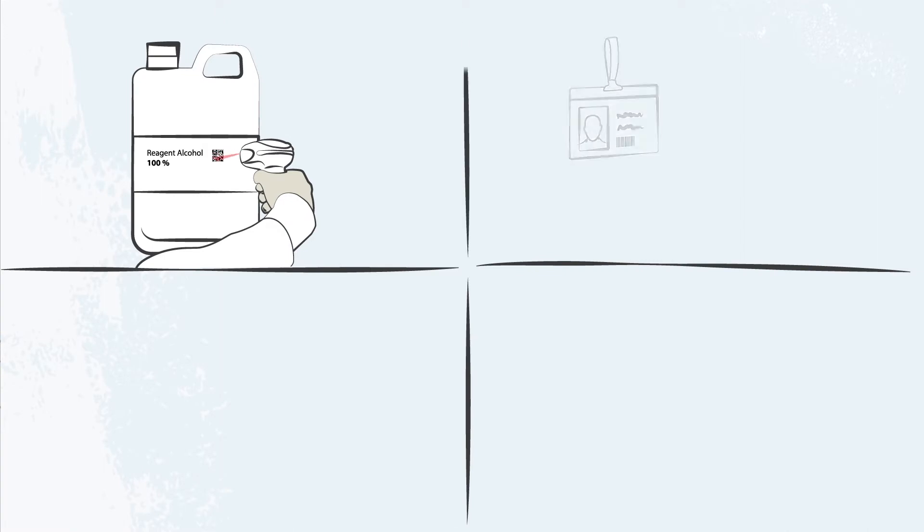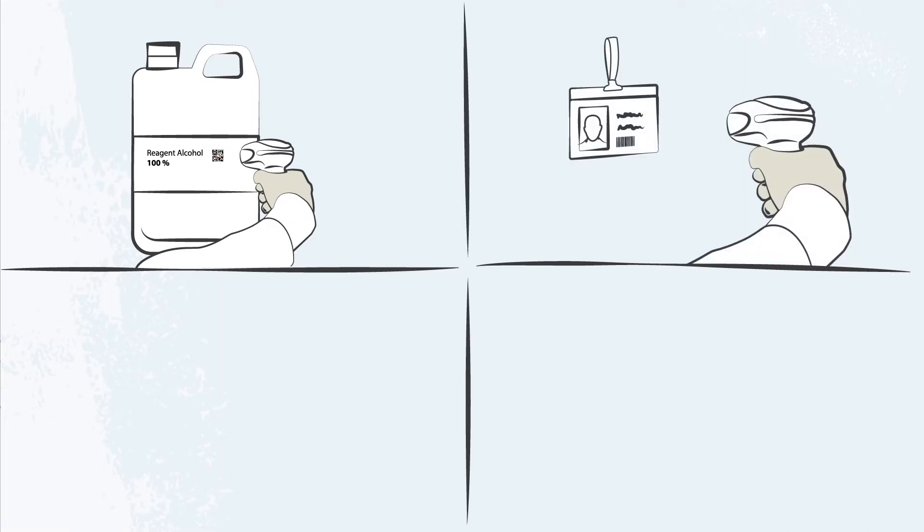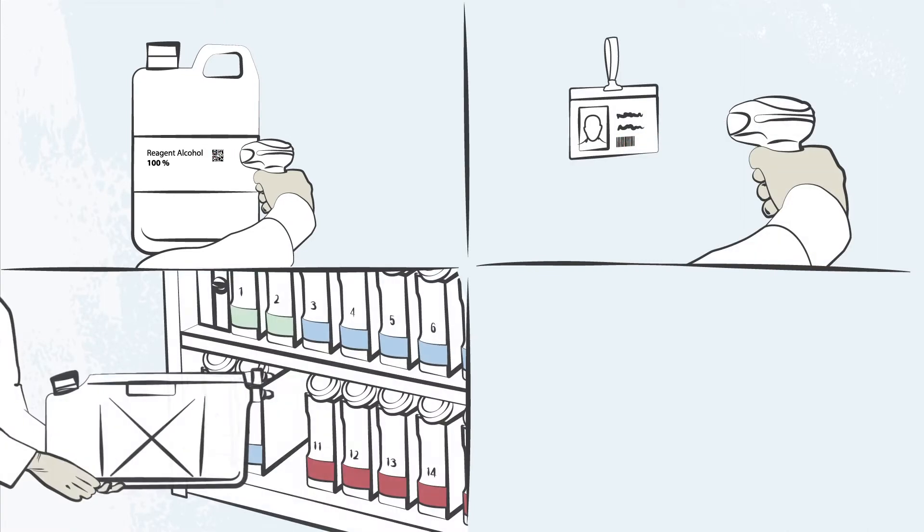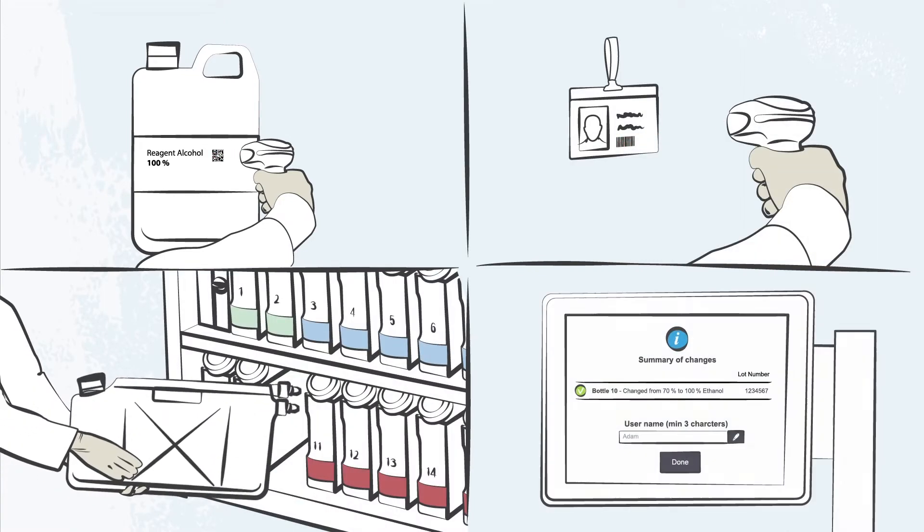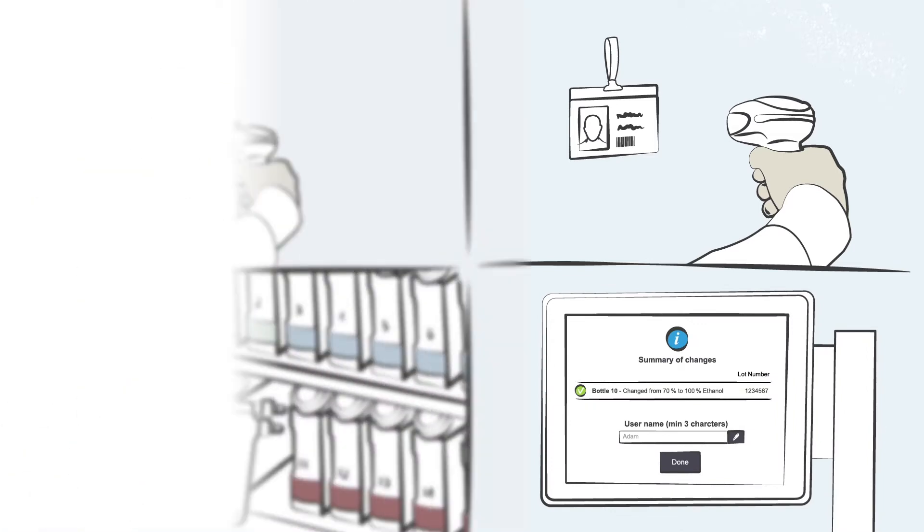Adam scans the lot number of the correct reagent container, scans his user ID, and confirms the exchange on the color touch screen.